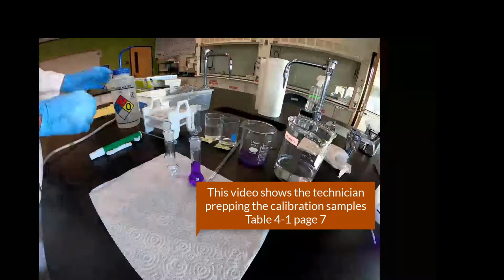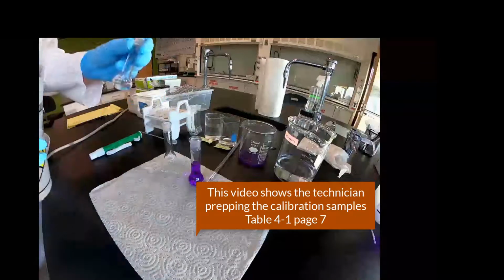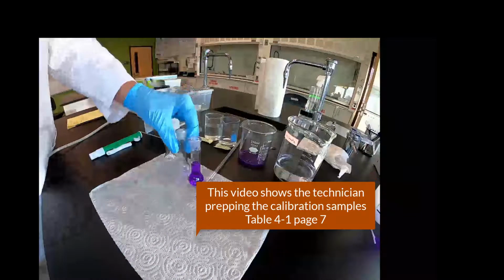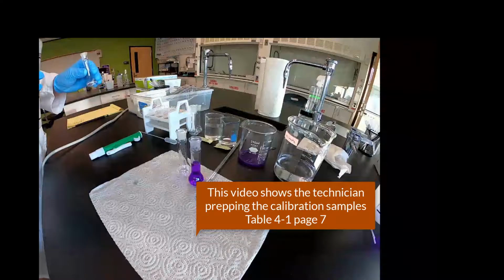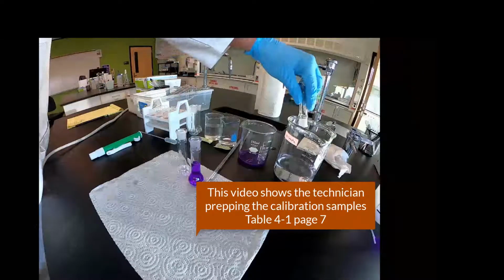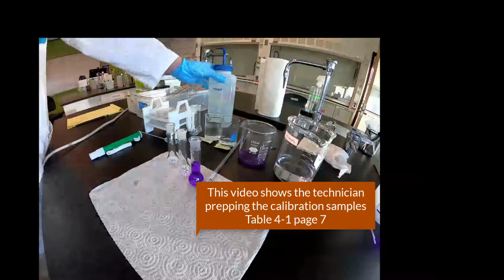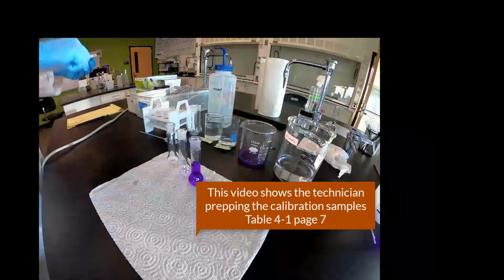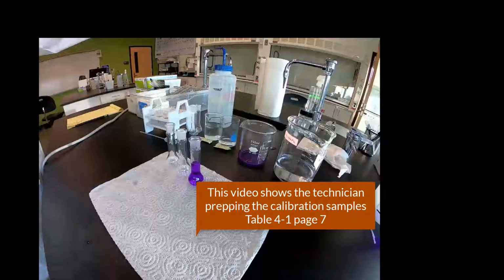Okay, in this step, he's going to do a dilution. Now it seems like they're prepping the volumetric flask the proper way, giving it a rinse with the DI water, which is what we're going to dilute with. Dumping that little rinse into the waste container. Now we're ready to prep sample number 2, 5 mils, diluted up to the 10 mil mark with water.